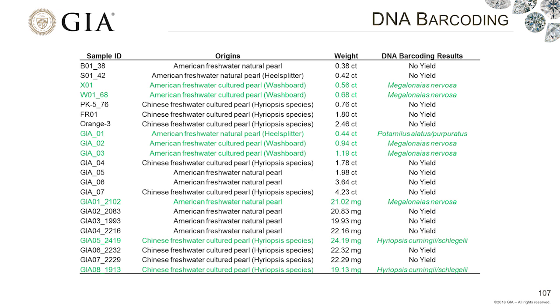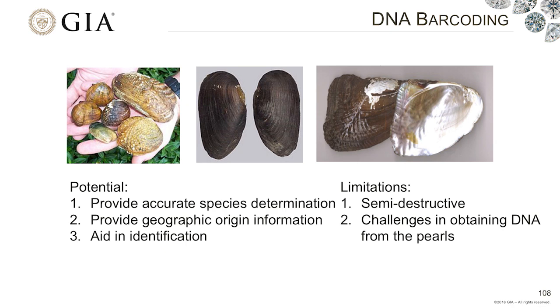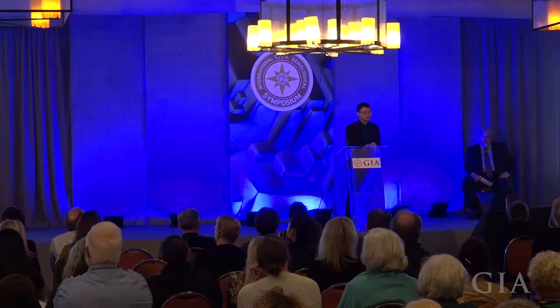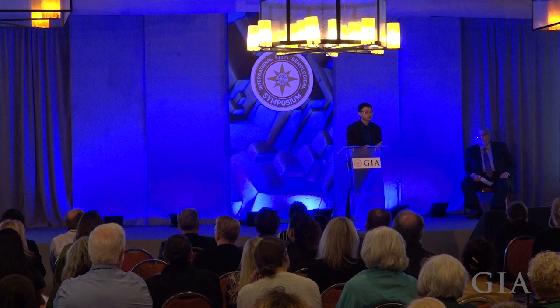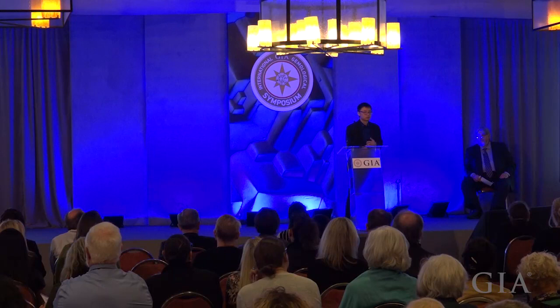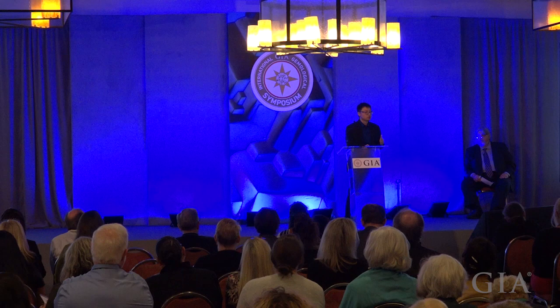However, if you look at the table, many of the samples do not have enough DNA yield. The limitation, similar to carbon dating, is that you need to get some powder for DNA extraction — somewhere at least 10 milligrams is needed. However, even if you do that, there's no guarantee that you will get DNA from the sample. Maybe there's not enough DNA to start with, or maybe the pearl has been processed or treated in a way that DNA has been degraded or destroyed. For example, Chinese freshwater pearls are usually bleached or heated in chemicals, and all these processes could damage the DNA content inside.